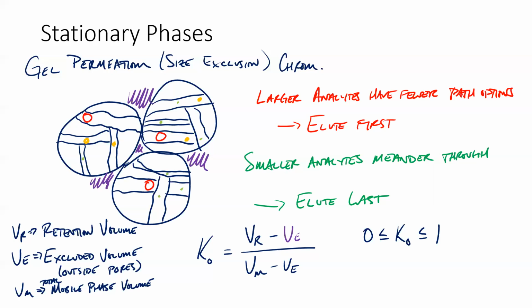And you'd make that curve, and then you could analyze your unknown. As long as it's the same type of polymer, you can just plot it on that chart and figure out roughly the size of your polymer, that particular size distribution for that polymer sample.